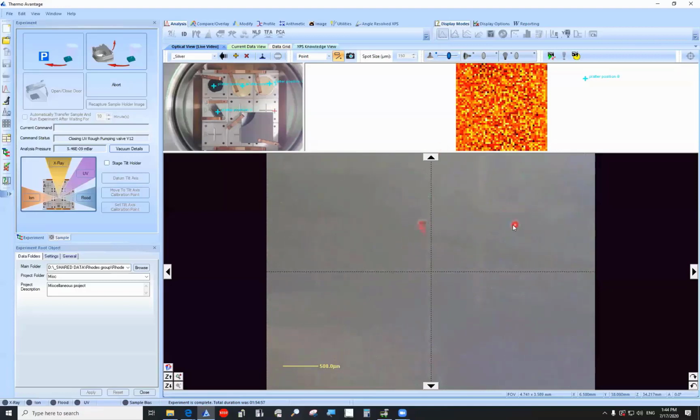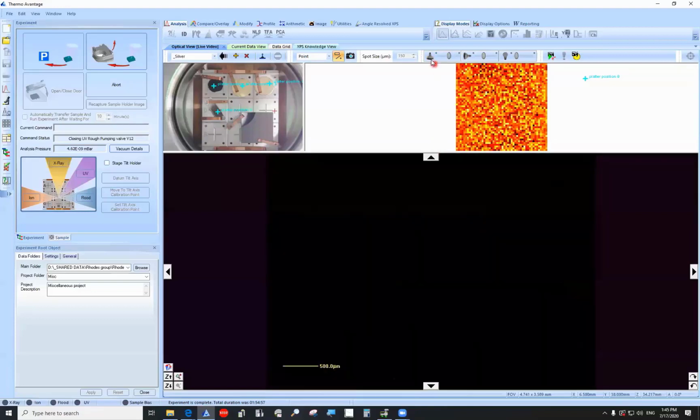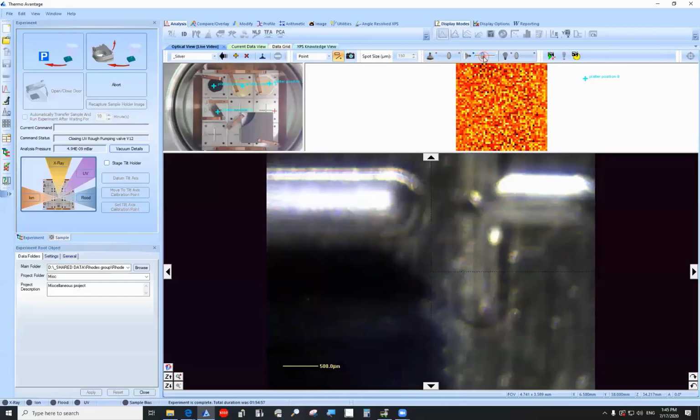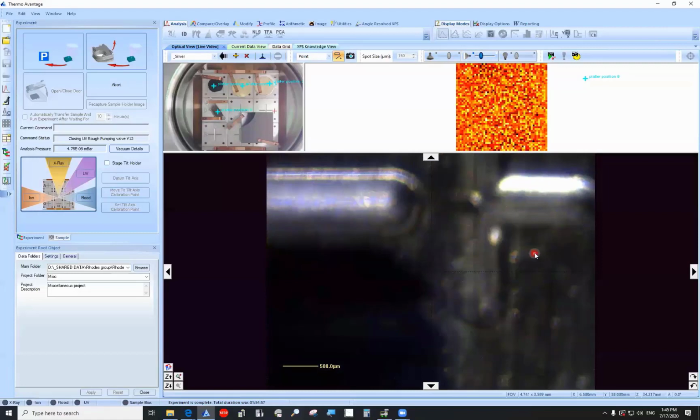All right, so this is one type of illumination. This is what you would call your coaxial light. It basically comes straight down through the same path as your camera feed. And on specimens like this that don't have a whole lot of asperities or roughness sticking off the surface, you don't get a whole lot of contrast here. So one other option you have is to not illuminate the sample in a coaxial fashion, that is along the same axis as your optical capture, but rather illuminate from the side. And now, as you can see, there's my little slider right here, I get much better contrast for depressions or particles or things sticking off the surface.